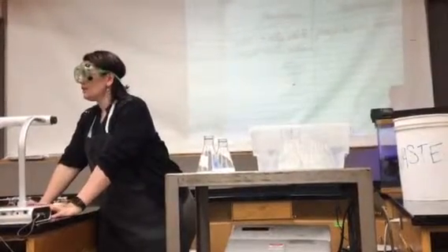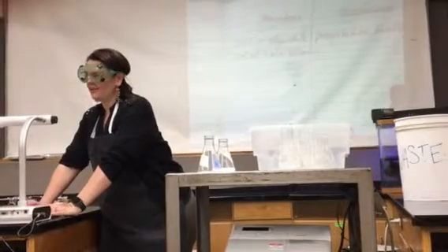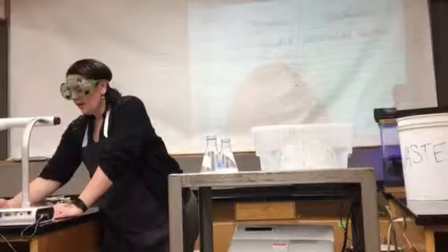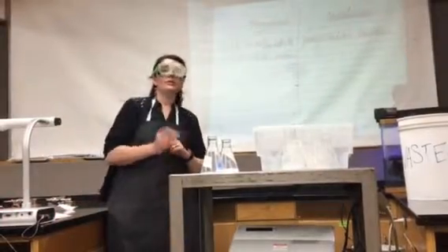The precipitation dissolved, makes the color go back to blue. Okay. So your job, you can go ahead and turn that off.